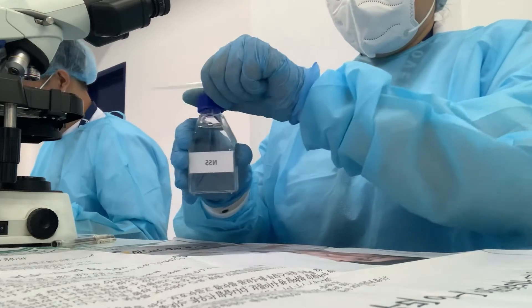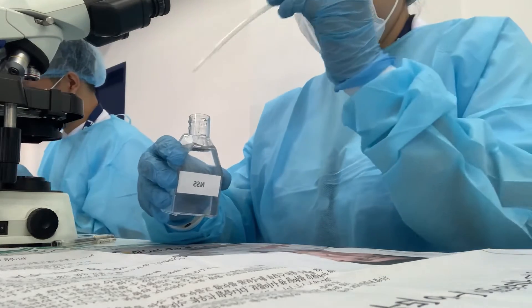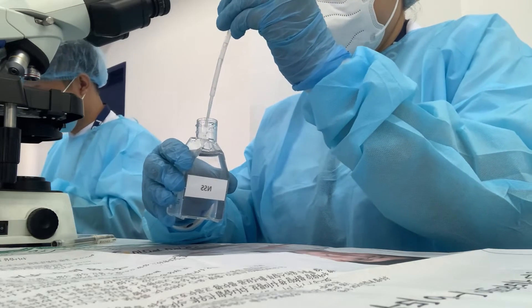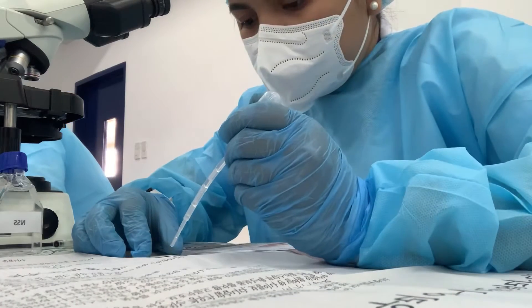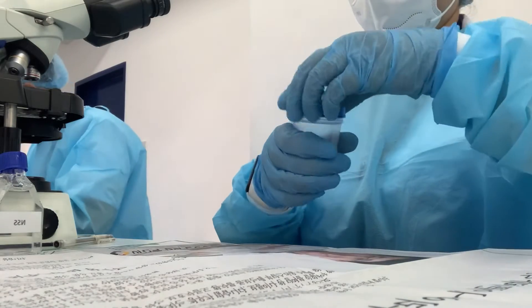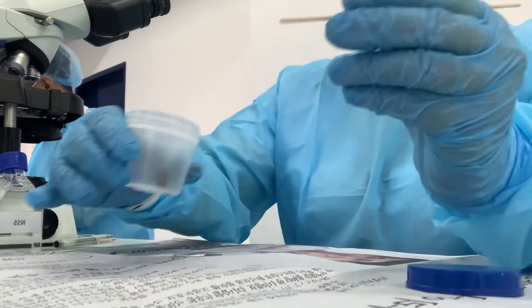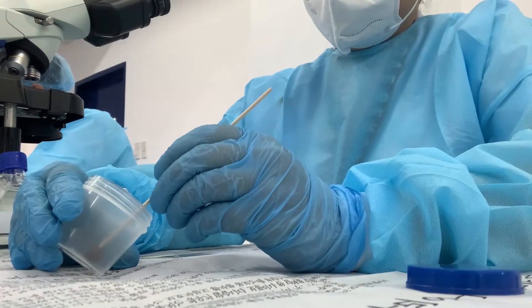Let's start off by placing a drop of saline solution on the center of the left half of the slide. With a wooden applicator stick, pick up a small portion of the stool specimen with the size of a match head and mix with a drop of saline to form a suspension.